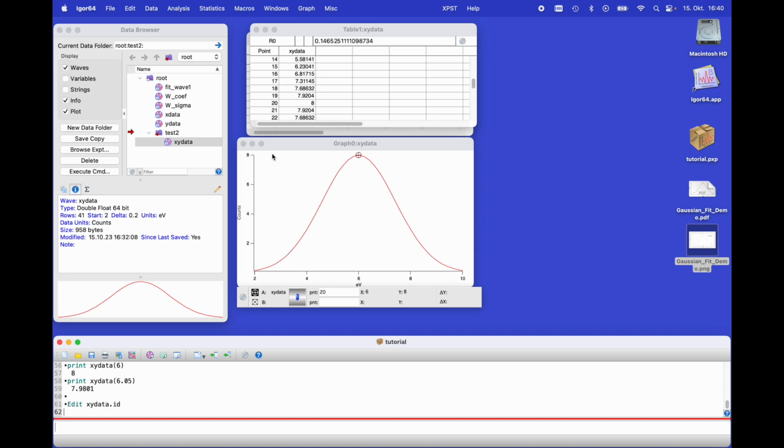So first of all, for each photoelectron spectra, IV curve, and so on, you now only need one wave with a unique name. And second, when working with the names and waves from the command line, you also only need to care about one name.